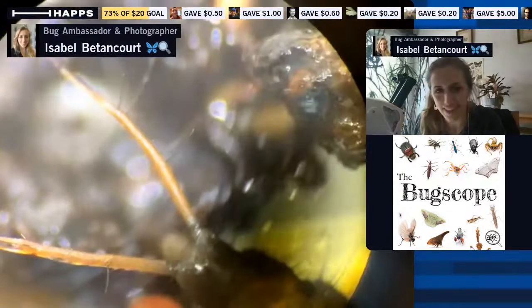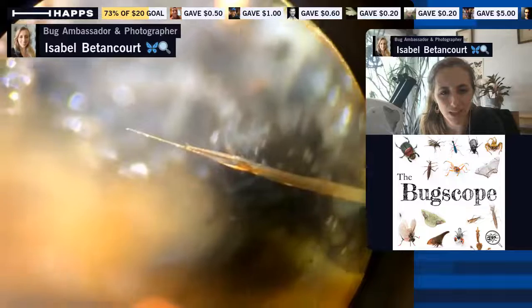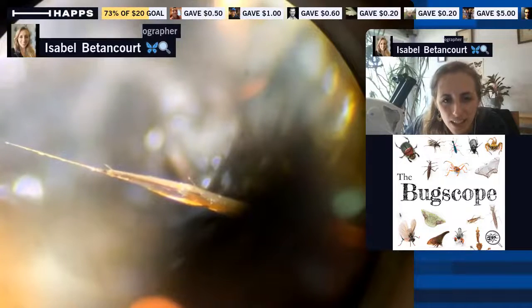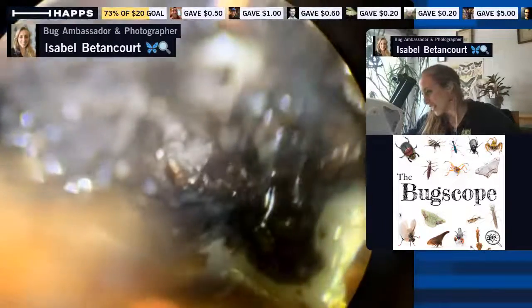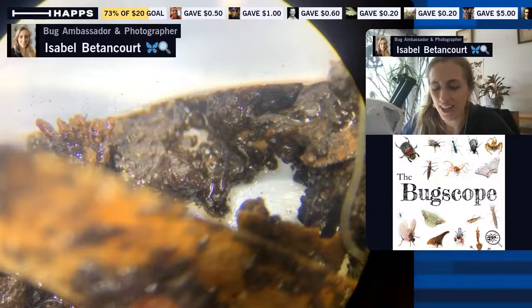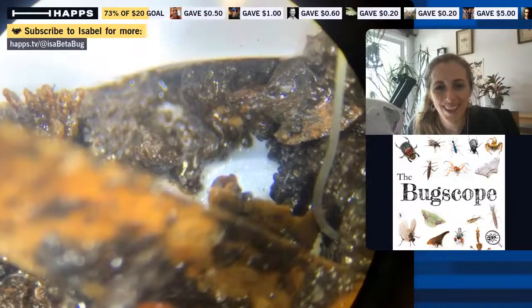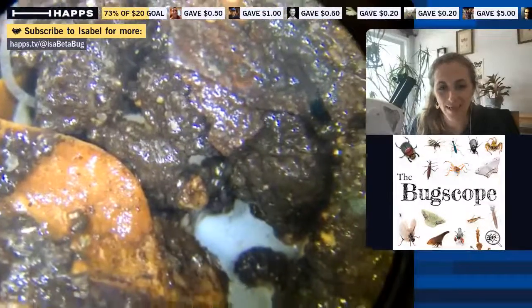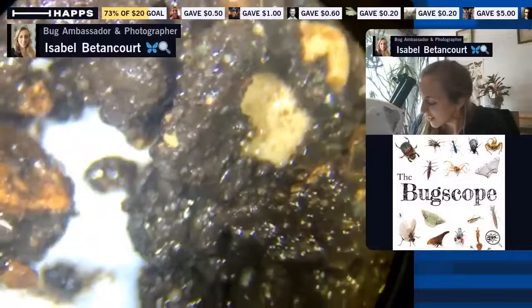Let me zoom in as much as we can and see if anything else sticks out in regards to its morphology or body form. The next microscope I'm getting — this current one goes up to 65x magnification, and the one arriving today is more than double that, so really excited. Hopefully it won't be too difficult to light, because the more magnification you add to something, the more difficult lighting can get. Hi Lars.